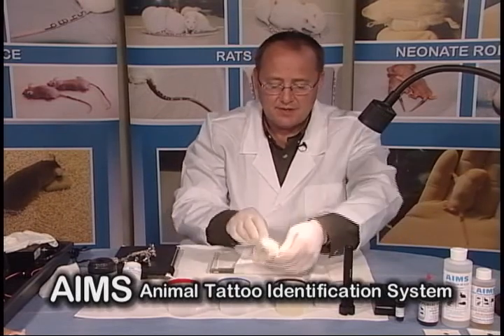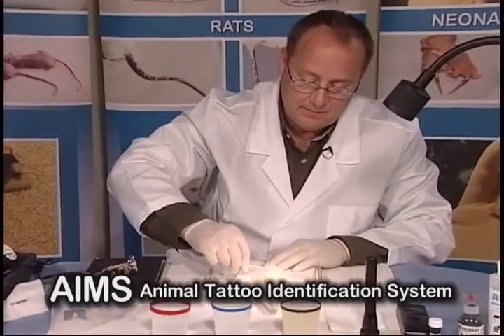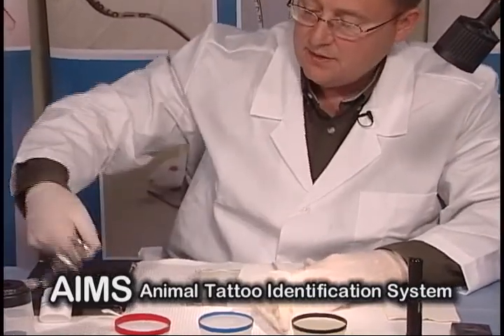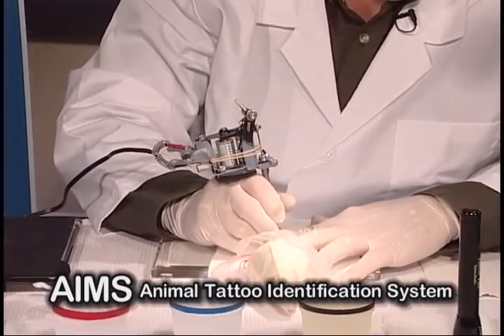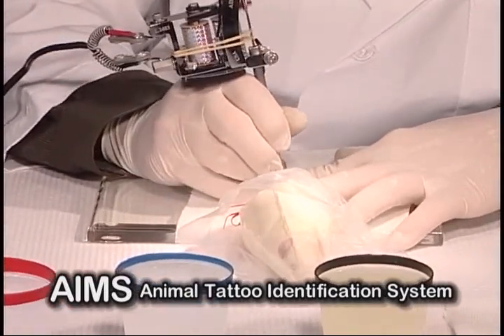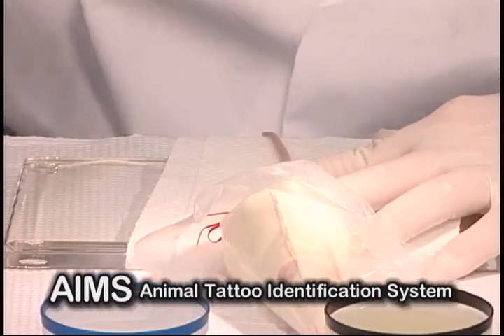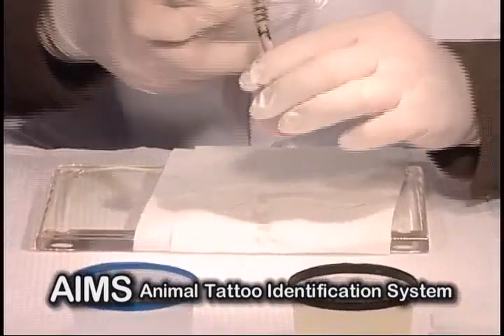Once you have your rat properly restrained, you simply lower the tail onto our tattooing platform. You prep the tail, take your machine that's been properly adjusted, and you tattoo your number. You inspect your number and it's as simple as that.